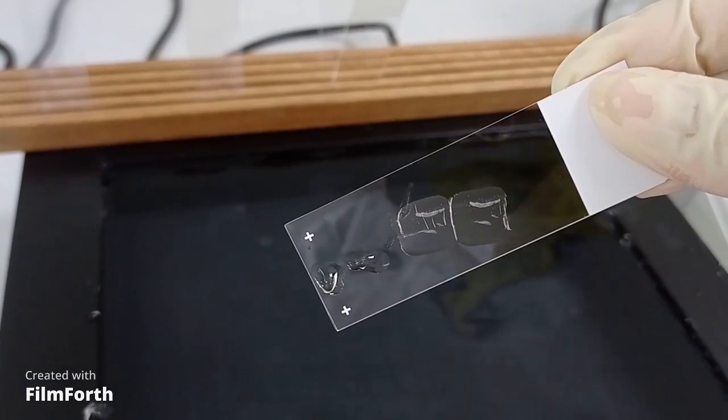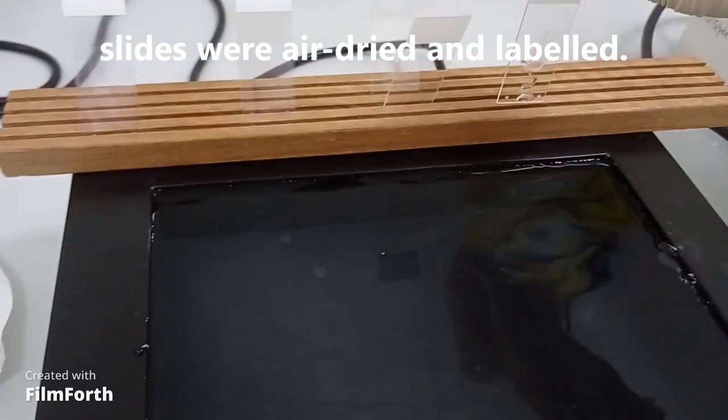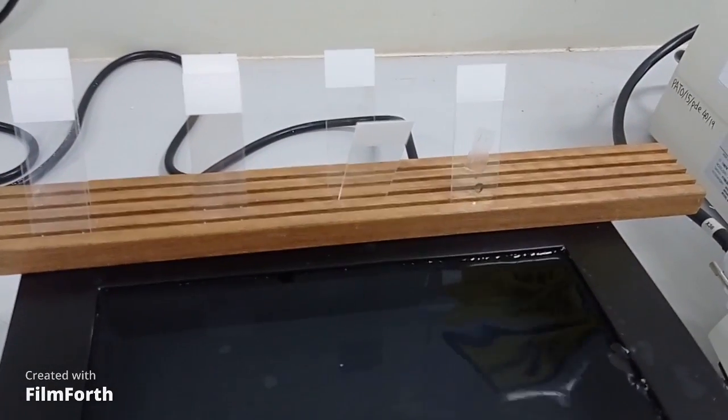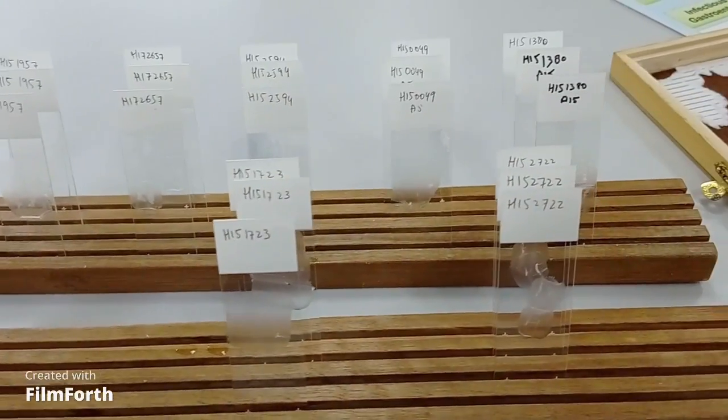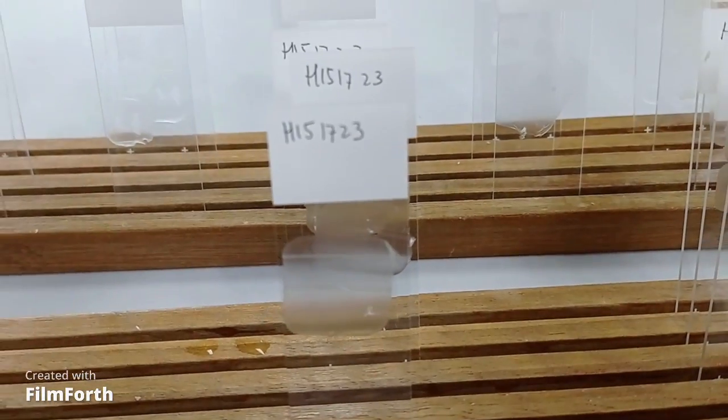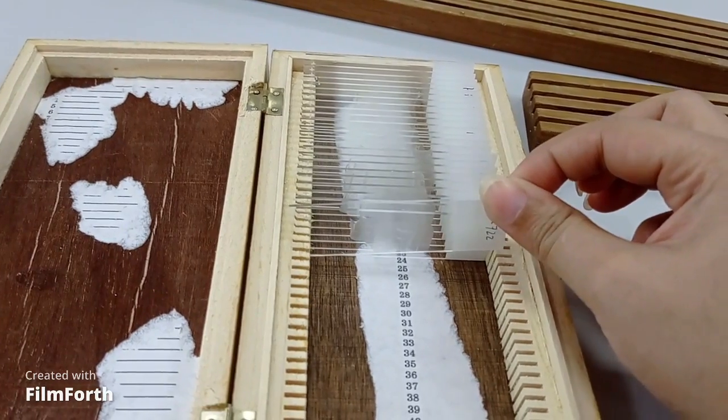After fishing the microsections onto the slides, let them air dry and label all of them. In the last step, store all of these slides in a proper slide box until you start with the next step.